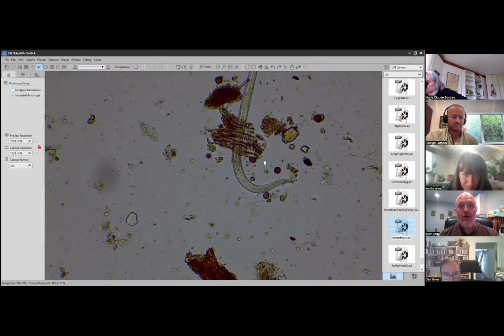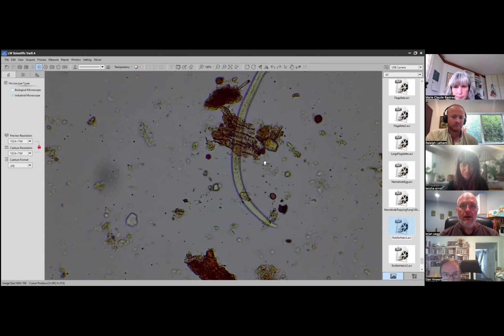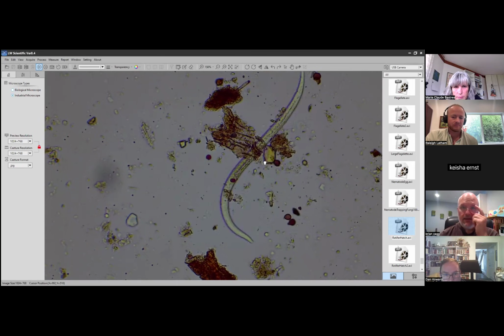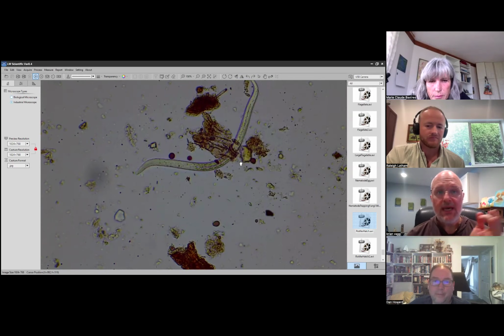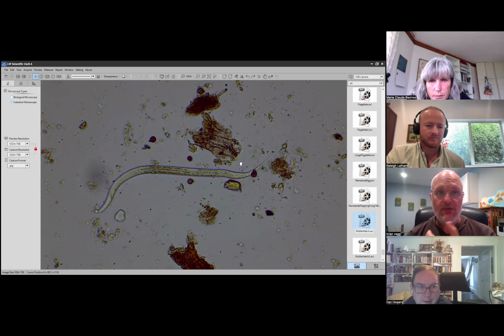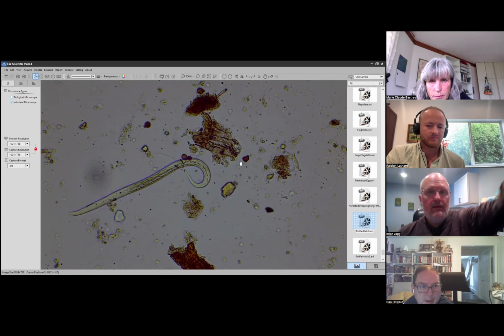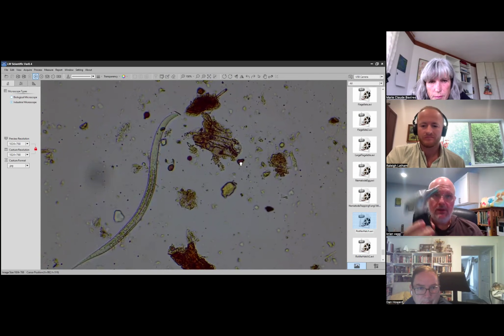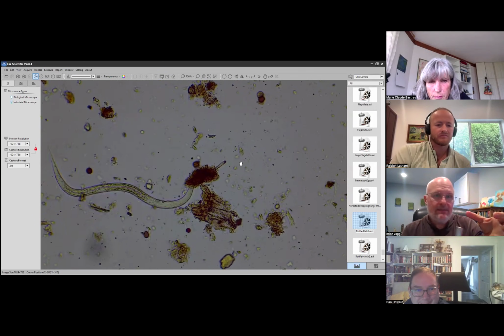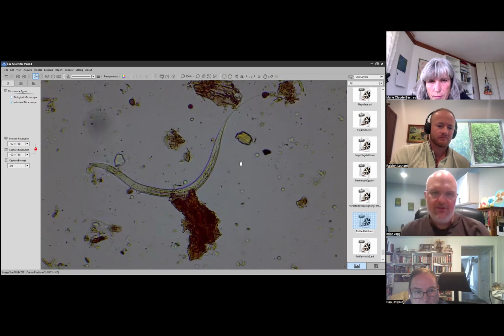A lot of times when we look at nematodes, where we're trying to assess what they are, we use the morphology to figure it out, and you might have to heat stun. When you heat stun, you have to heat up the underside of the microscope enough to stun it without actually damaging or killing the nematodes. I use something like this, a torch, to do it. It takes some technique though. You have to practice it. You heat up underneath the slide, and it will stun them into silence, really, or no motion.